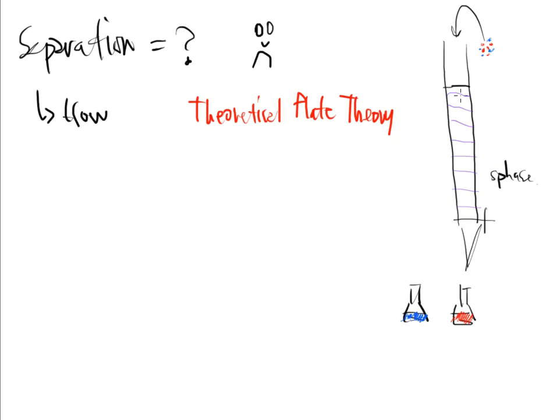In the beginning, I get my red sample and I get my blue sample or my components into that first sliver, the first cut. And then they said in the next step, or in the next piece, what could happen is that the red could maybe travel a little bit further behind, depending on the separation technique, right?